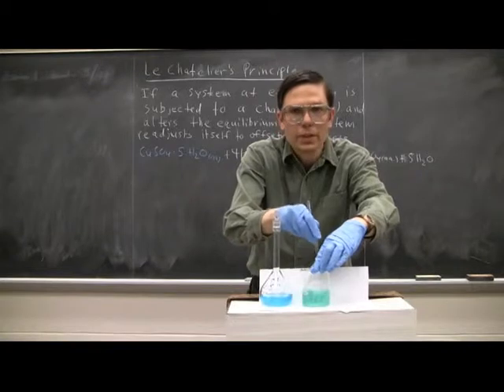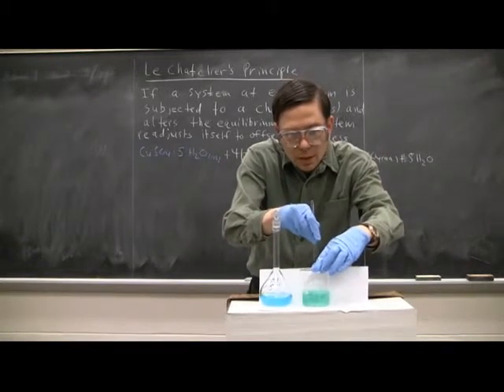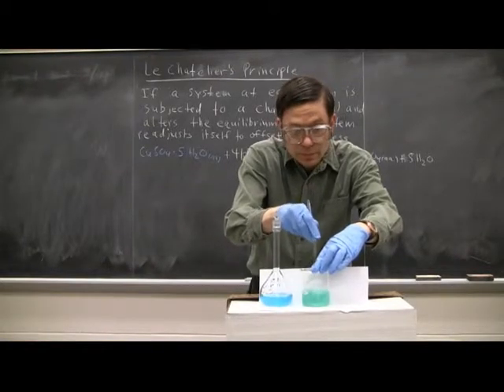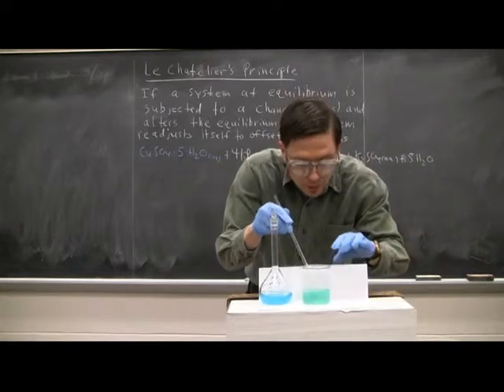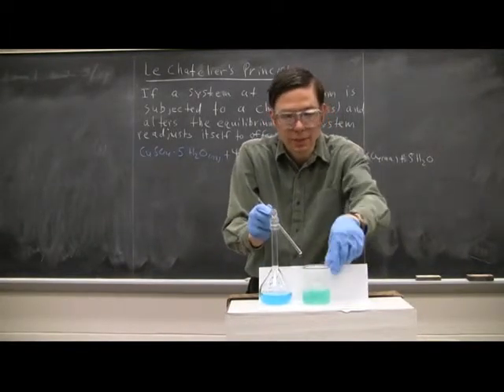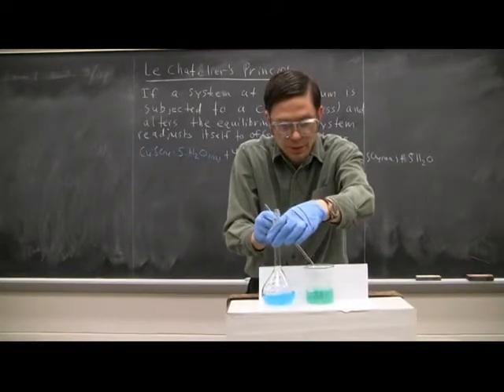You can see that we are getting a greener color. Okay, I'm going to leave it with that. It looks pretty good right there. So you can clearly see we have a green colored solution here versus the blue that's showing up over here.